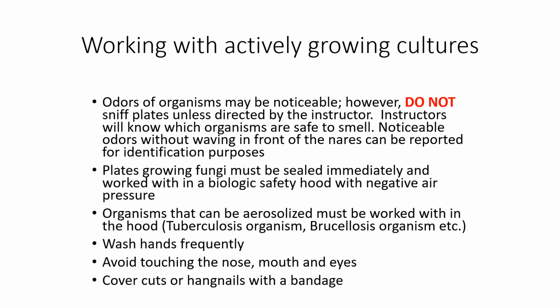Now, working in the microbiology laboratory, you may actually smell certain odors of organisms, and those odors can be helpful in the identification of certain organisms. However, you do not want to sniff any plates unless directed to do so by your instructor. The reason why is there could be fungus on those plates, such as Coccidioides, or other things such as Francisella tularensis that could cause you to get very, very sick. And so you never want to sniff plates unless you are directed to do so by the instructor. However, you may notice odors emanating from your plates, and those odors can help you identify those organisms.